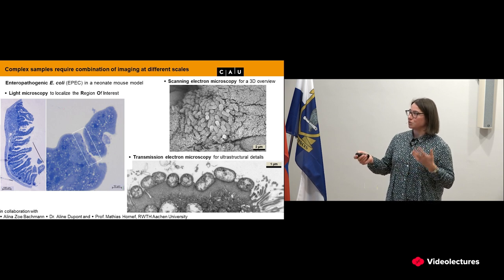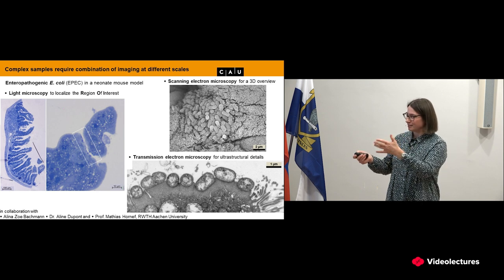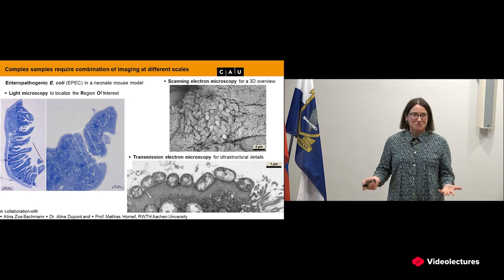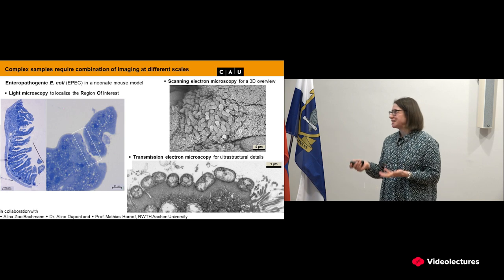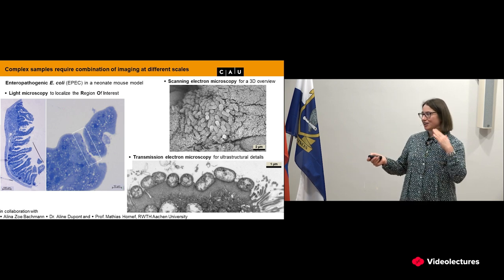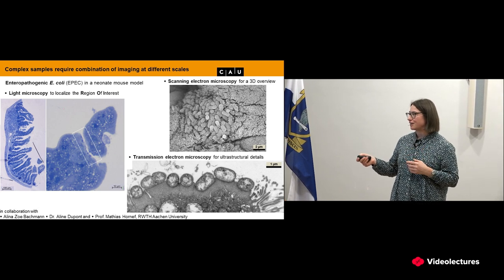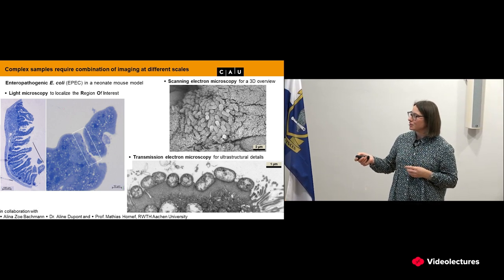And again, we first make these semithin sections, as we call them, so 1 micrometer sections. And it's just about right to be able to spot bacteria. So these are bacteria. And now in the EM, here I stop, I make thin sections, and now I have bacteria in the electron microscope. Can it be more beautiful than this? So we see the bacteria are colonizing the apical surface of intestinal cells. They're not internalized, and they modify the surface.